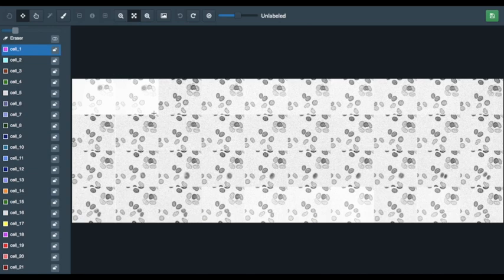Each panel is a snapshot in time, which progresses as you move from left to right and top to bottom. One thing to remember is that, as these images are a progression through time, cells might change position between panels. Not only that, cells may also be moving into and out of the screen, resulting in an increase and then a decrease in clarity and intensity of the cells. Because of this, you're going to have to keep track of which cells are which.